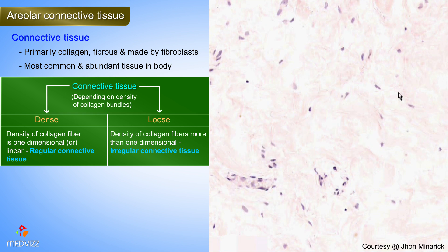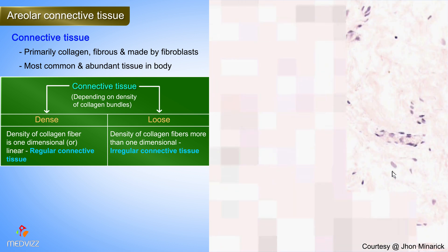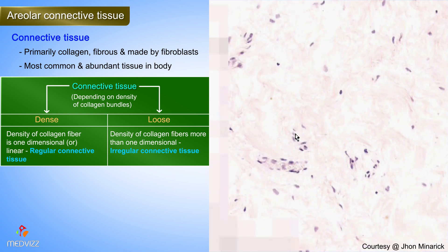Notice the waviness of these collagen fibers and how they go every which way. There are areas which appear to have a lack of fibers, and in some areas there will be adipose tissue as well. This would be another indication that we're dealing with loose irregular connective tissue, also known as areolar connective tissue — and that's exactly what we're looking at here.